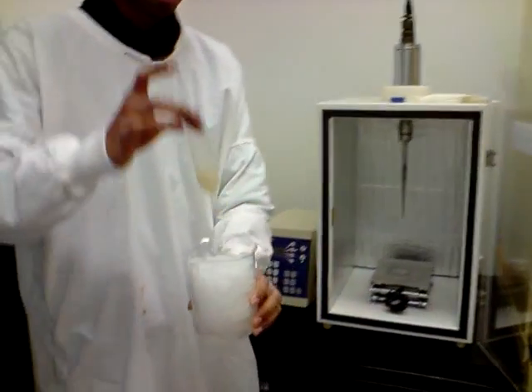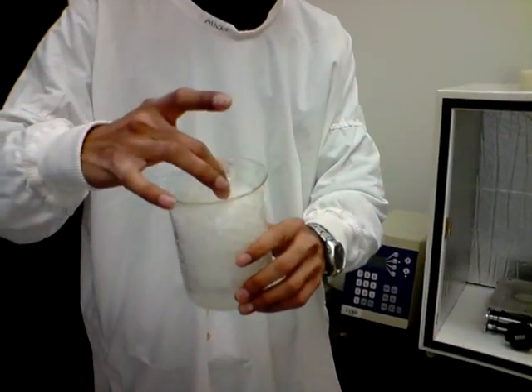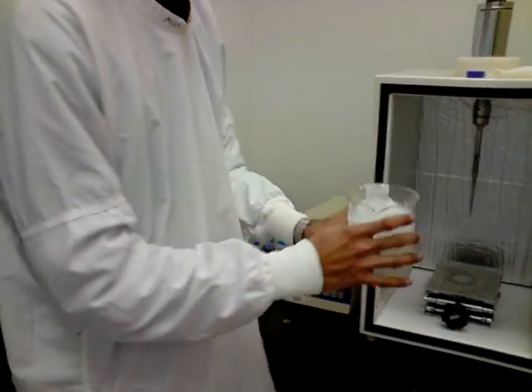And as you can see here, we have put the sample into the ice bath and brought it down to cool temperature. So once this is cool enough, we will start the sonication process.